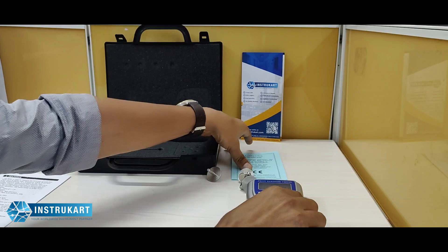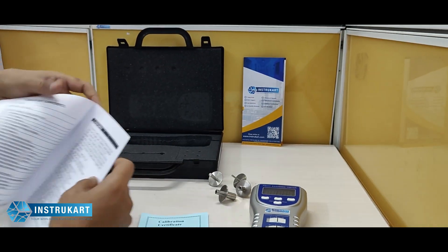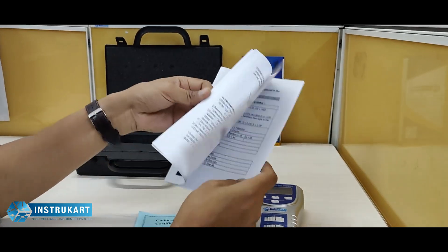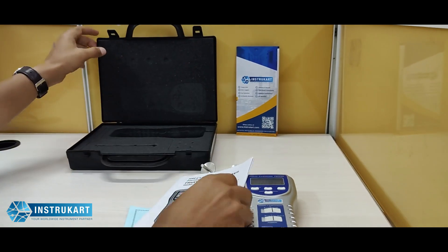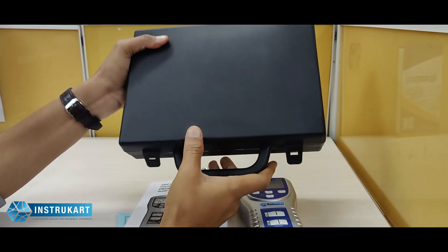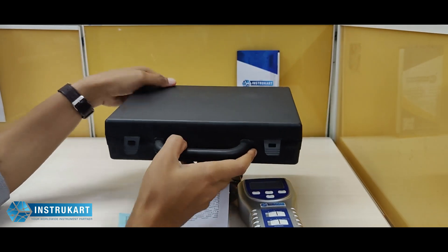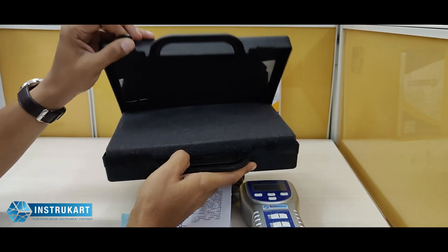It comes with a calibration certificate as standard from the factory and an instruction manual for reference on settings and other details. It also has a hard carrying case to take the item into the field whenever required.